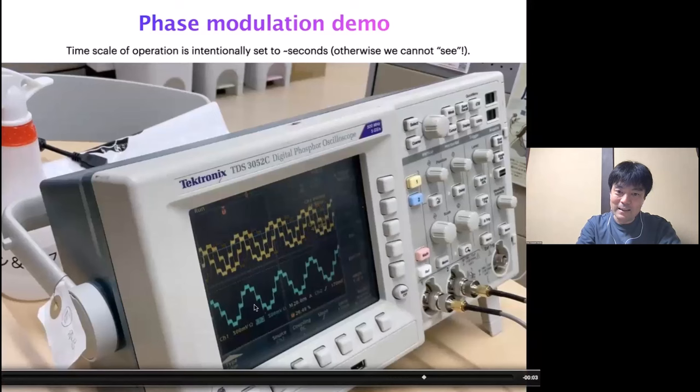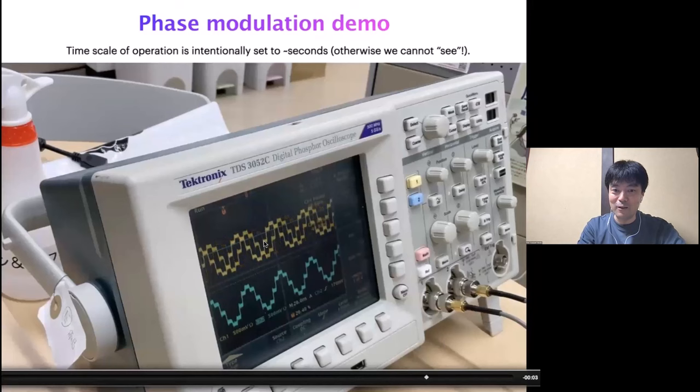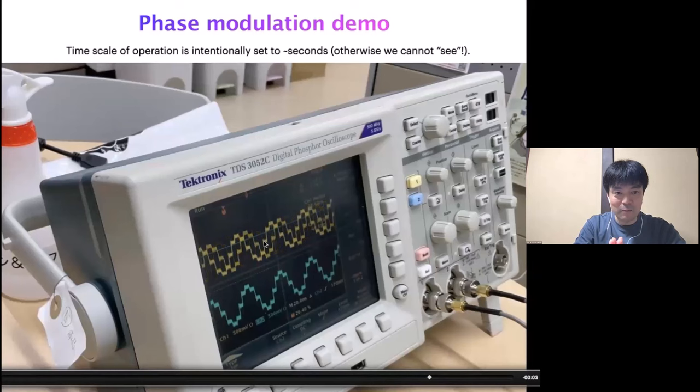We can freely change the phase of the output. In this example, the blue channel has a fixed phase — just continuous oscillation — while we intentionally shifted the phase of the other channel, shown in yellow. The time scale is intentionally elongated to the order of seconds for demonstration; normally for NMR experiments you need to do it on the order of microseconds or even shorter. Our spectrometer achieves a time resolution of around 6 nanoseconds, so for most NMR purposes it works.